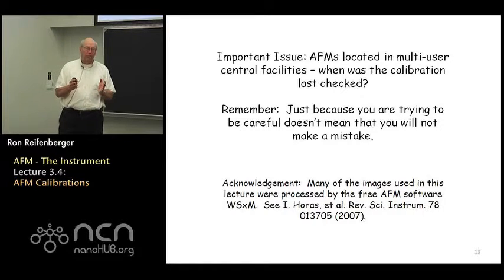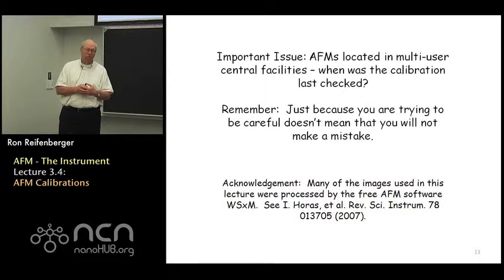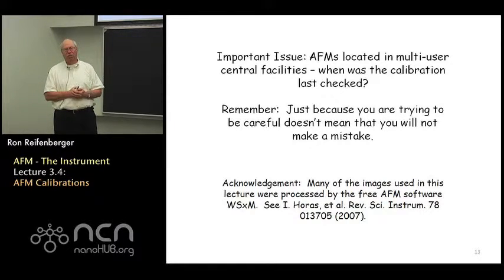So I think, if you're associated with a multi-user AFM in some central facility, it's important for you to constantly be asking, when was the calibration last checked? Who's doing the calibration checking? Right? If you don't do that, I'm afraid you may get numbers out of your instrument that may not be as accurate as they could be.